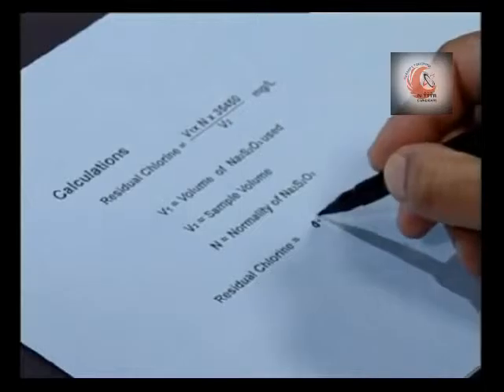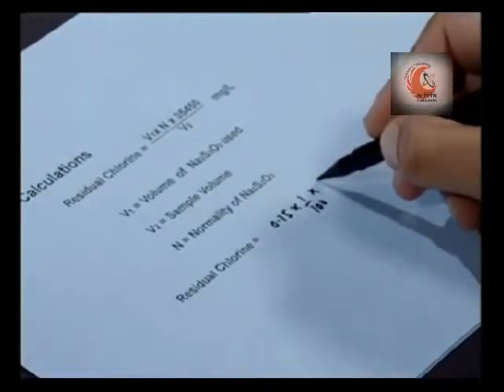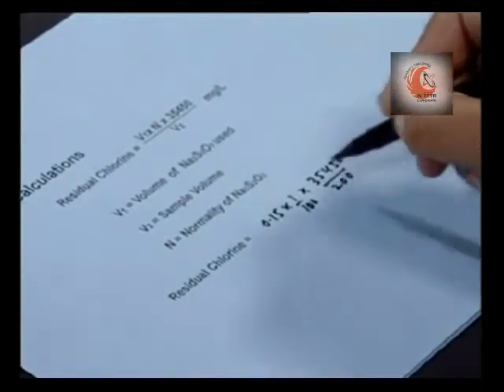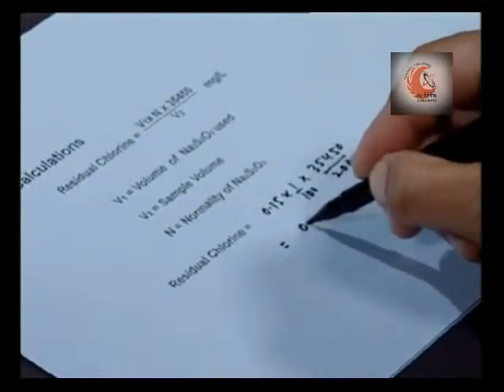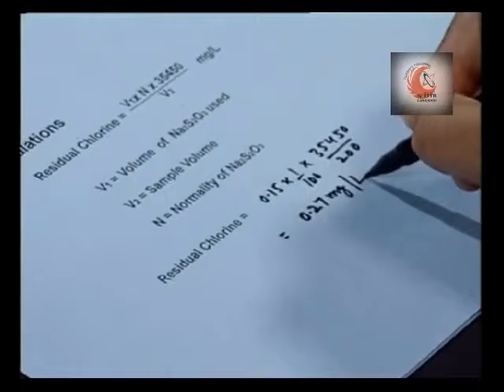The residual chlorine value for this case is determined as equal to 0.27 mg per liter.